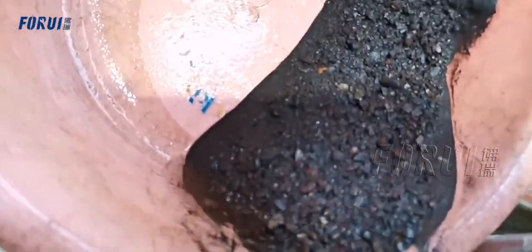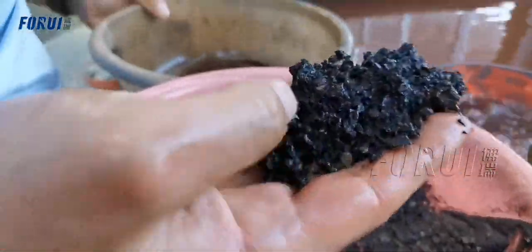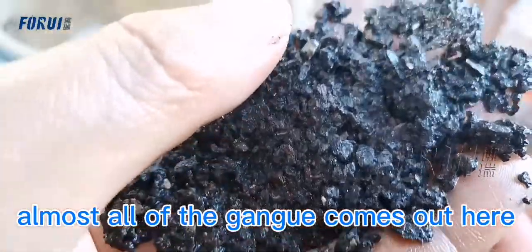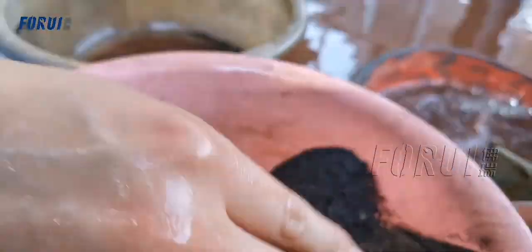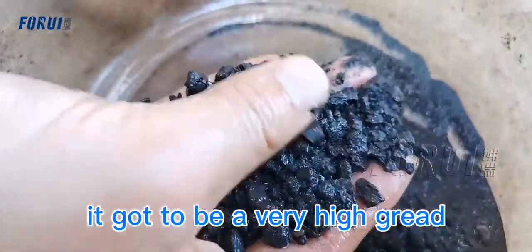This is a tank — let's see. And almost all of the gangue comes out here. It's got to be very high grade. Well done.